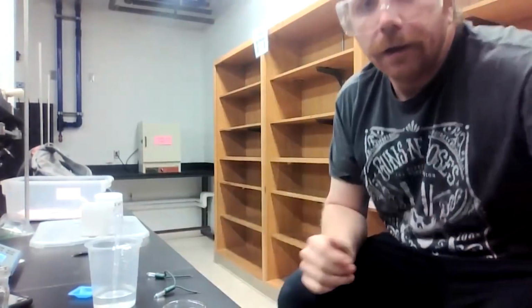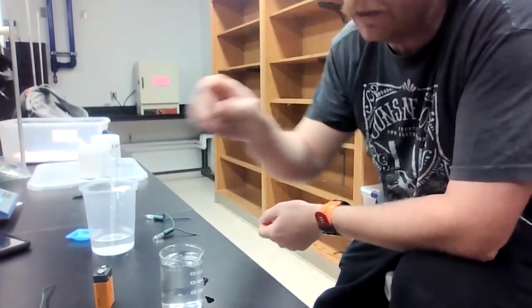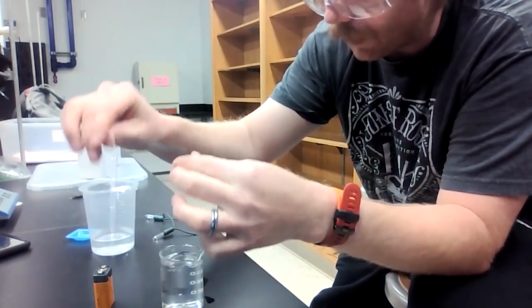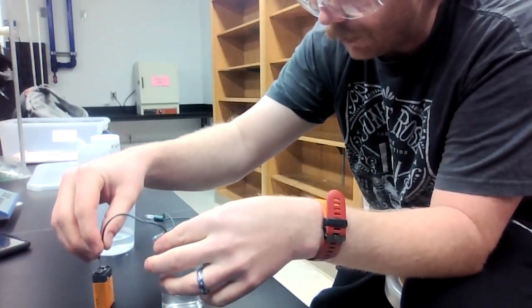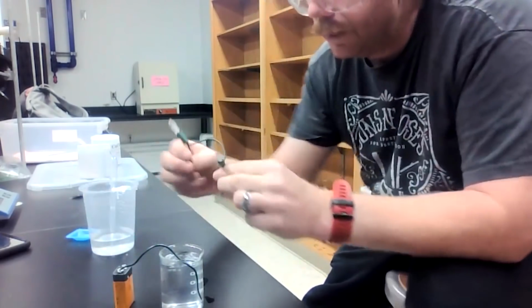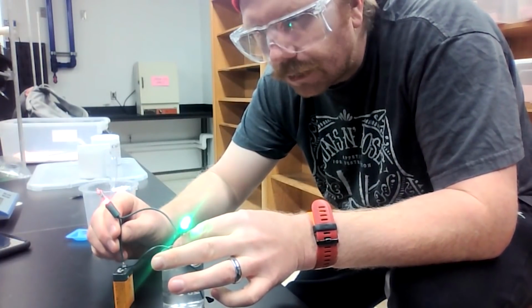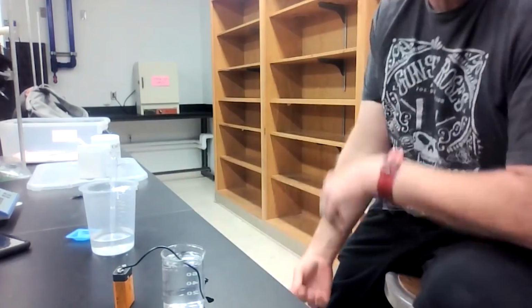Now, experimental trial number 1. I already looked at this and I know that it's an ionic solution. It's a soluble ionic solution. I saw those ions or that solid dissolve. Now, it doesn't matter which terminal I connect to. I want to, however, get my battery basically in contact with my solution. And so here we go. That's lined up. Now the question is, will it light up? And yes, it does. So this tells me whenever I have sodium ions and chloride ions in solution, I get my solution to light up.